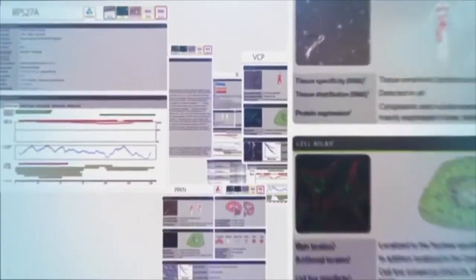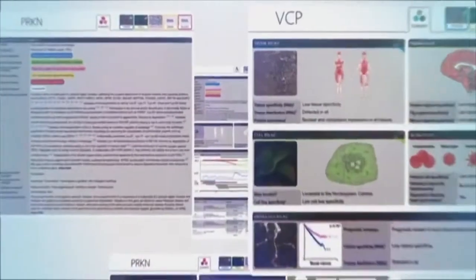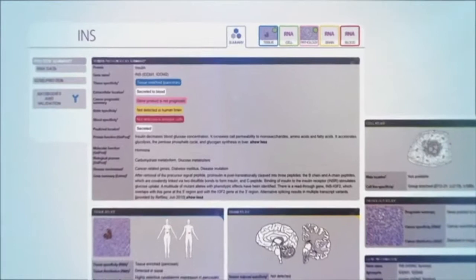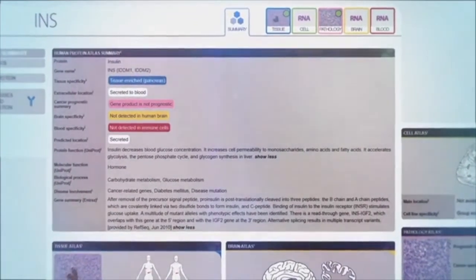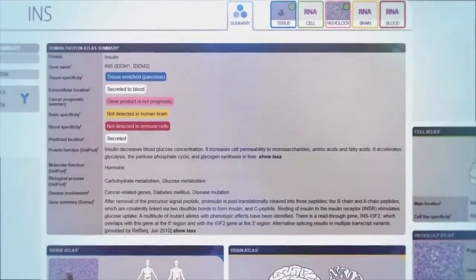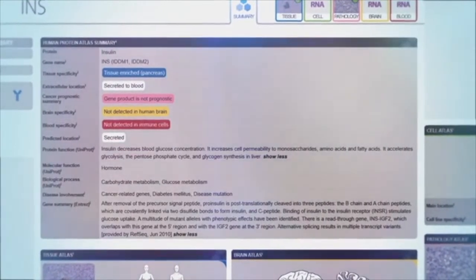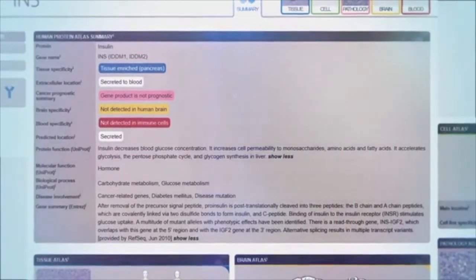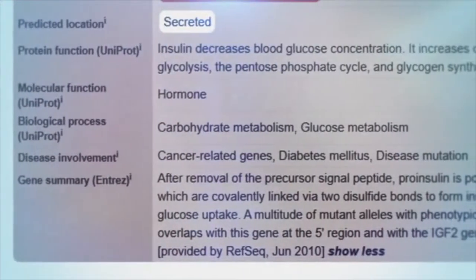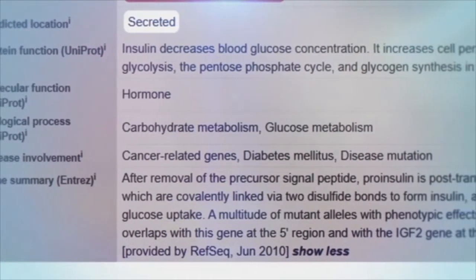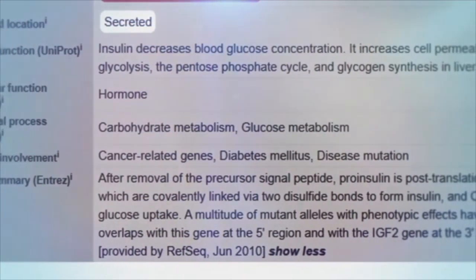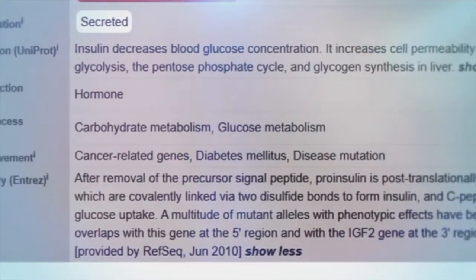For each protein, a page has been created to allow researchers to get a summary of the information gathered by the content of the different parts of the human protein atlas. For example, the information for insulin involved in diabetes is shown here. The summary page also gives information about the function of the protein and if the protein is involved in any human disease.